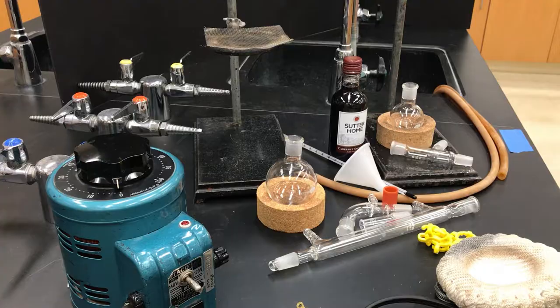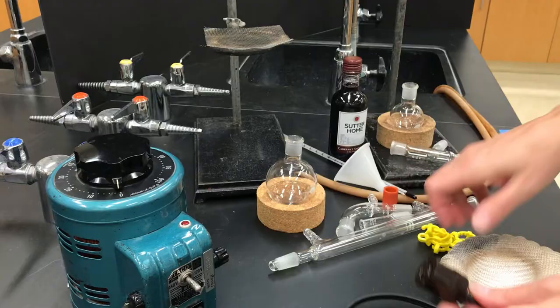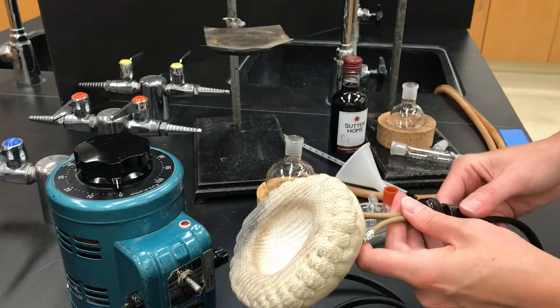The first thing I'm going to do is prepare my heat source. As organic solvents tend to be flammable, it's not a good idea to use a Bunsen burner. One alternative is a heating mantle, which is that white circular piece of equipment that I'm using.